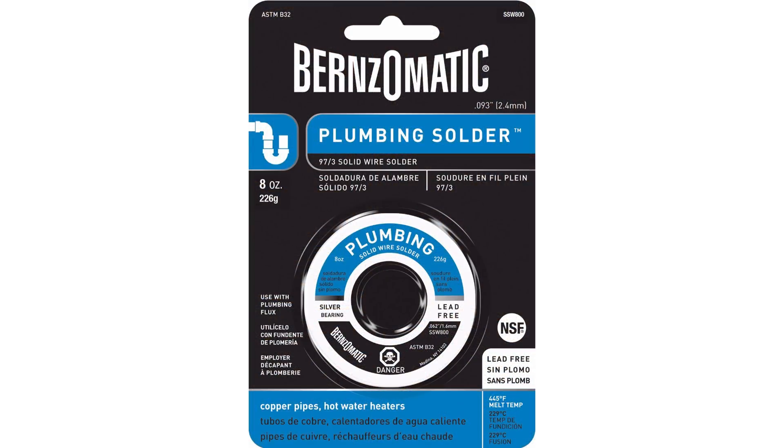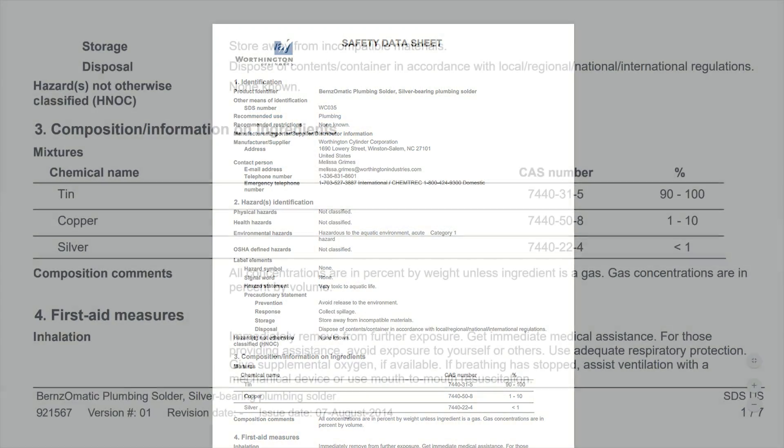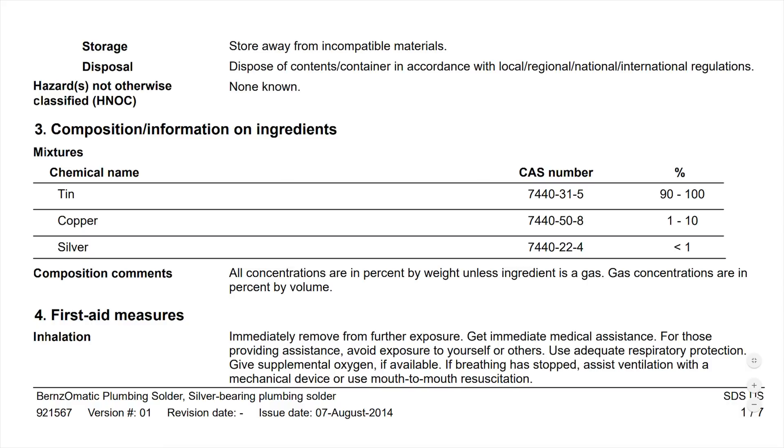First we need some tin. I'm using this lead-free tin solder. Check the material safety data sheet for the particular solder you're using and make sure it has more than 95% tin.